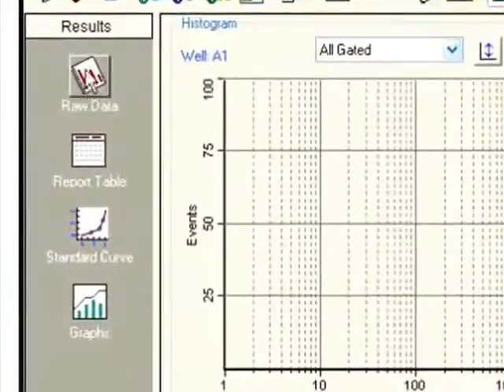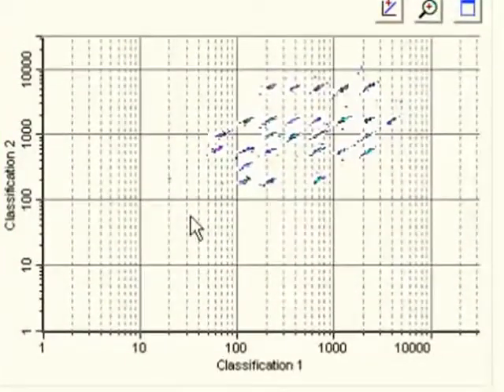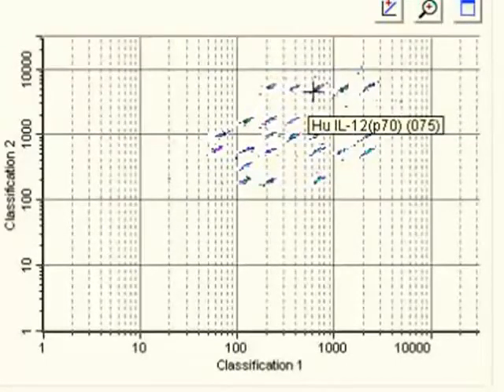And you can see here there are a variety of buttons that you can use to go into various aspects of the data. Right now we're in the raw data. Just to show you, these are the bead regions that were used. So there are 27 different analytes. If I mouse over them, you can see what they are: IL-17 as an example, IL-9, and so on. And these bead regions are sorted essentially.